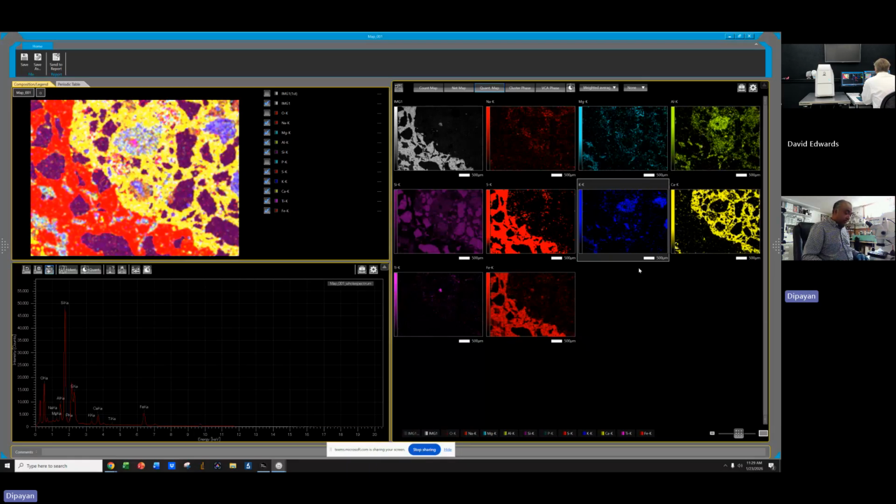It was extremely helpful, Dave, because these are the areas where I really needed some help. And this will greatly accelerate things when the phase analysis 2 comes. That will be for my floor model for my IT 200. And I know all this discussion will apply in there. Correct. Most of the stuff will apply there. Although the platform is a little different, I am getting familiar with it. It's not very, very different.